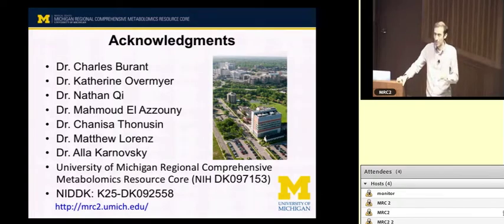I know this is a hand-waving kind of an answer. You'd need a good thorough study in your particular type of sample to really answer it, and not too many of those have been done. But there are metabolites that are just fine under those circumstances, and you can go back and run a metabolome, and the profile looks the same as it does when you started.